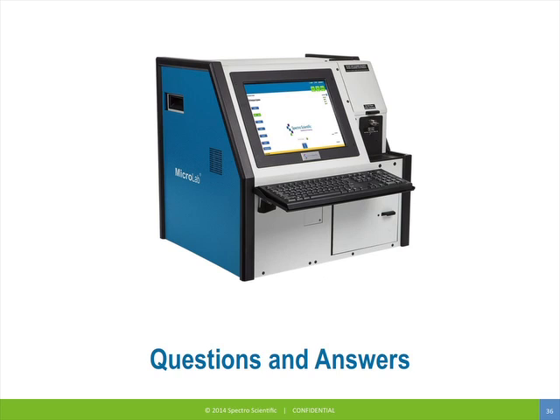Another application question. What is the accuracy of the MicroLab versus traditional laboratory-based analysis, and do we have any comparison data to share? The MicroLab is primarily used as a very good screening tool, for on-site analysis. It does not have the same detection as lab-based analytical equipment, but we can provide information in our data about what our detection limits are on the different tests.